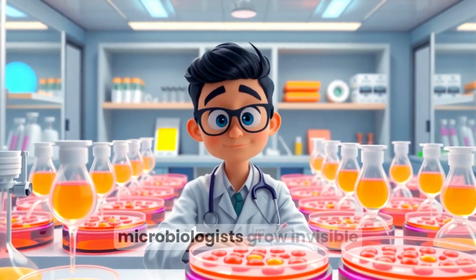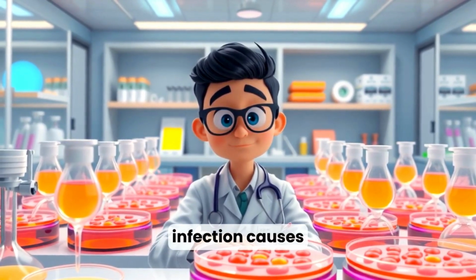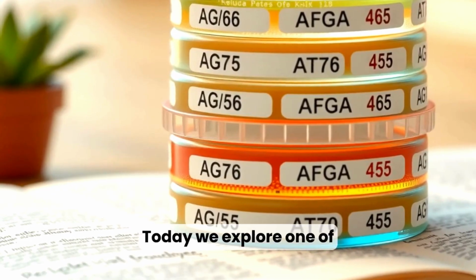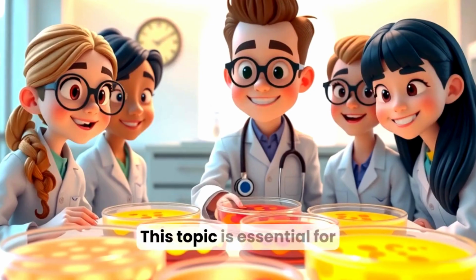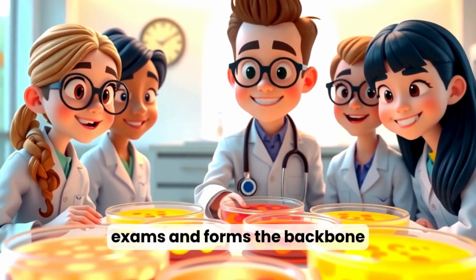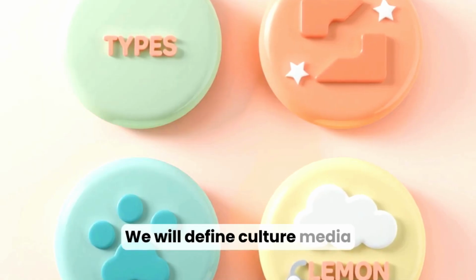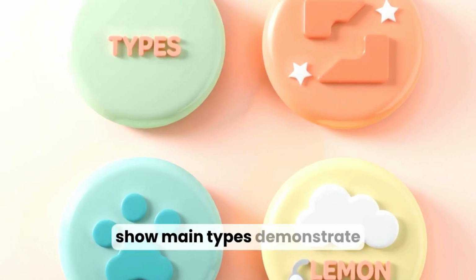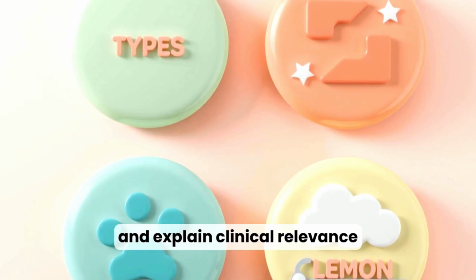Have you ever wondered how microbiologists grow invisible organisms and identify infection causes? Today we explore one of microbiology's fundamentals, bacterial culture media. This topic is essential for exams and forms the backbone of diagnostic microbiology and research. We will define culture media, show main types, demonstrate inoculation and colony growth, and explain clinical relevance.